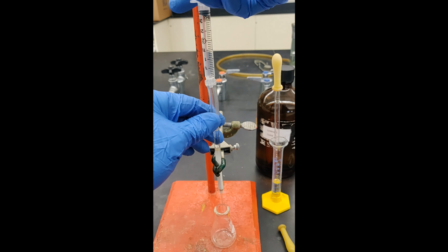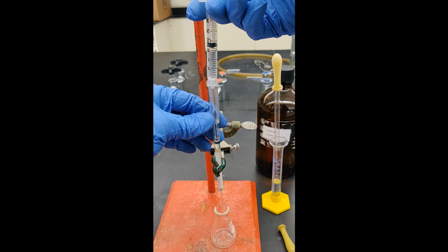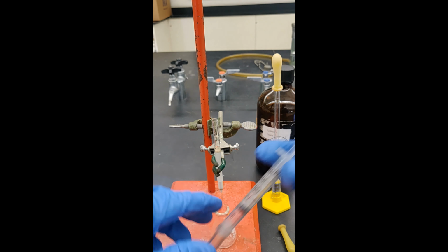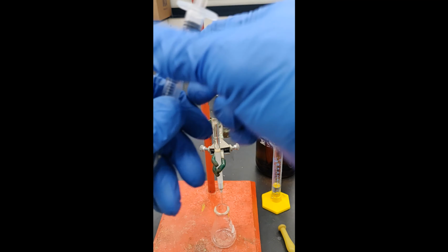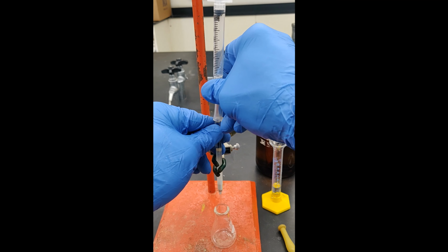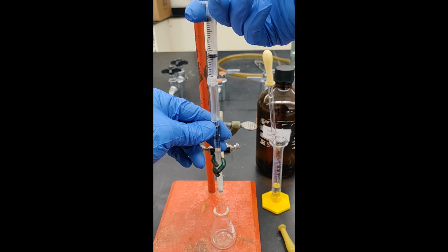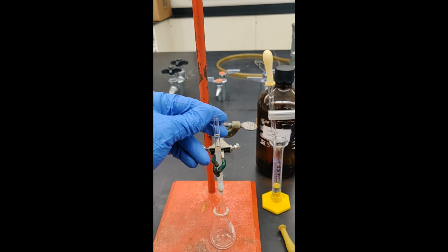Force the liquid through the silica gel into a 25 milliliter Erlenmeyer flask until the entire column is wet and the liquid level just reaches the sand above the silica gel. Add more Ligroin as needed. Do not push the glass of the pipette column too far into the tube of the syringe apparatus or rubber bulb if you're using that. You need to be able to quickly remove it to release pressure just as the descending liquid approaches the sand.